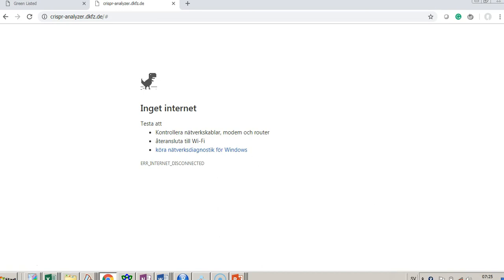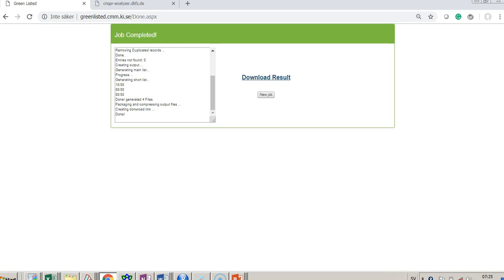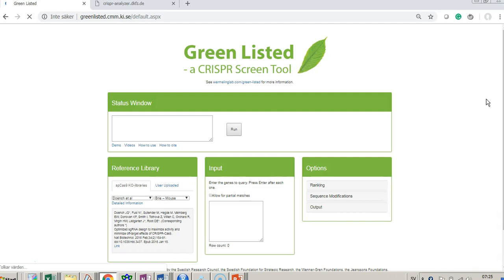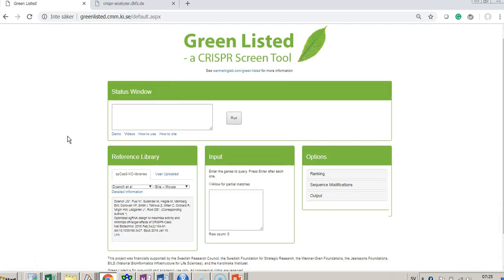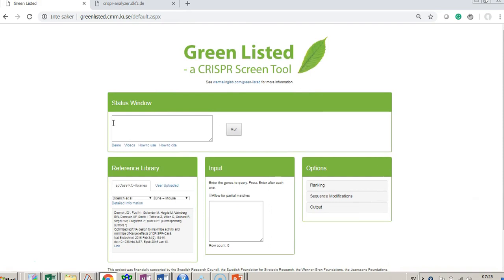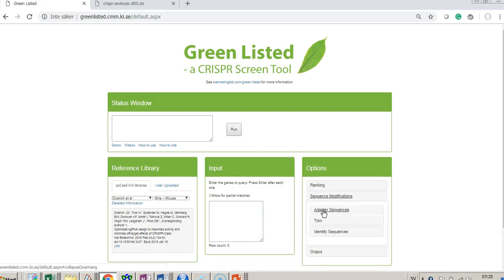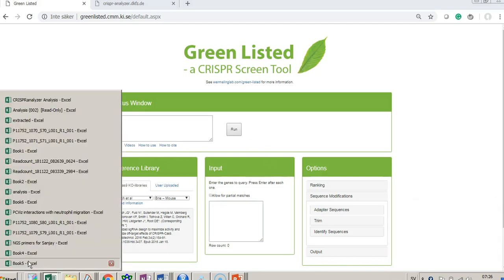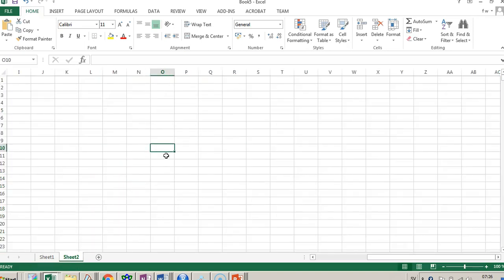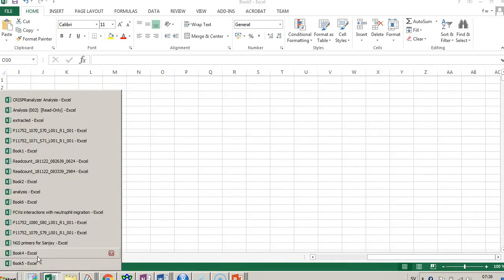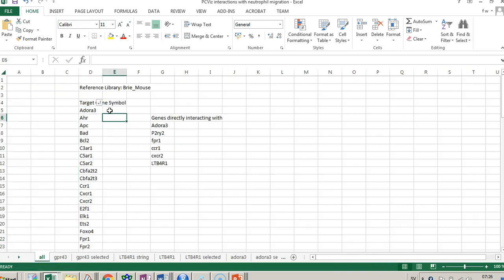Let's go to Greenlisted. Here is the Greenlisted software — there are plenty of videos about this, but basically you choose where you want your guides to come from, input your list, add overhangs for adapters, and press run. There are demos on how to use it and how to cite it.